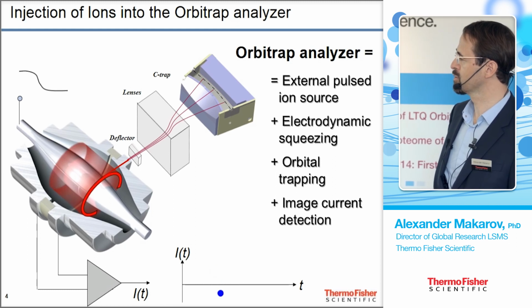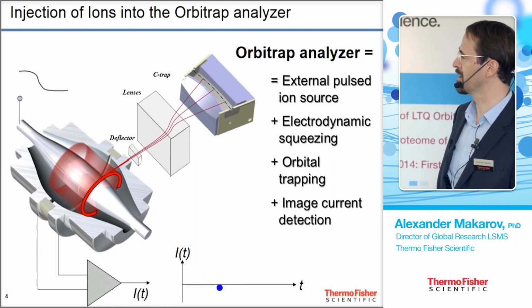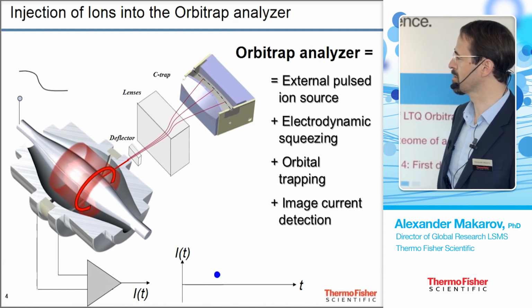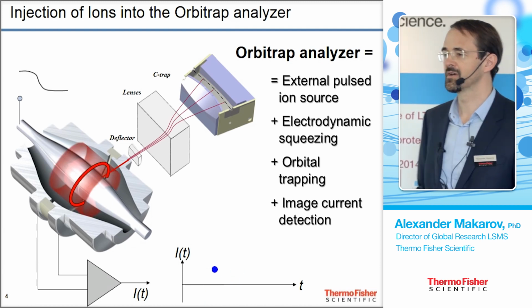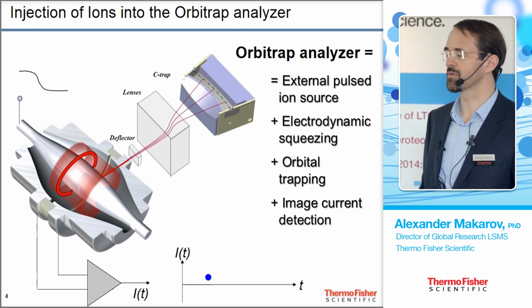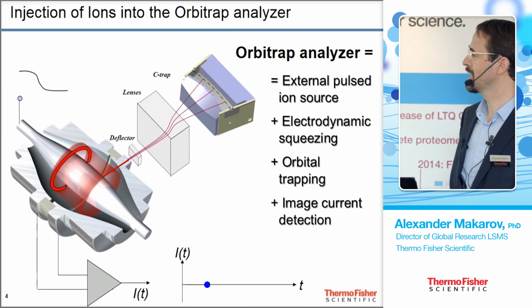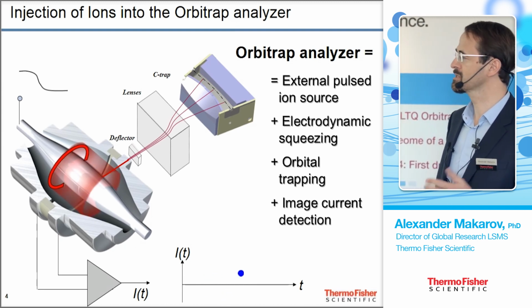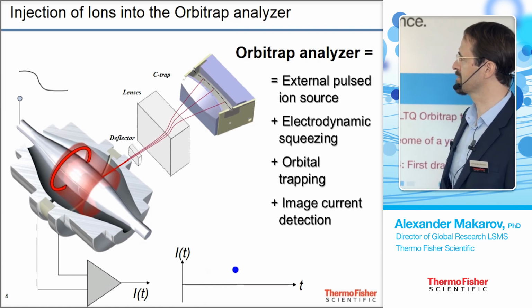And then we are detecting oscillations of those rings using a differential amplifier. As the ring goes back and forth, we get a sinusoidal signal on the output of the amplifier. For multiple signals, we have a superposition of multiple sinusoids, and we can deduce all frequencies here, and hence masses, just by inverse Fourier transform.